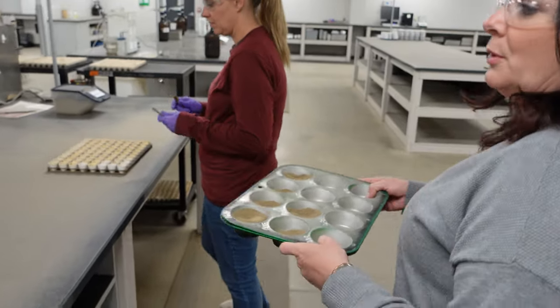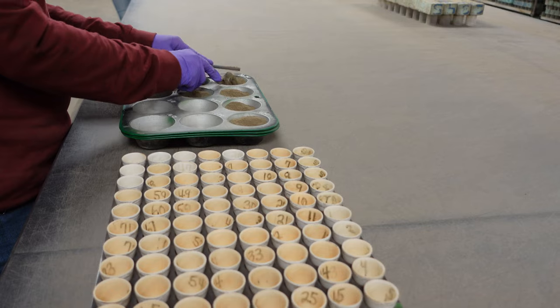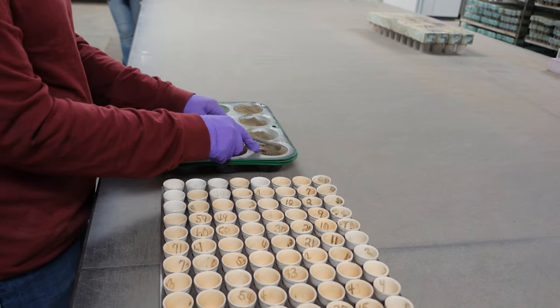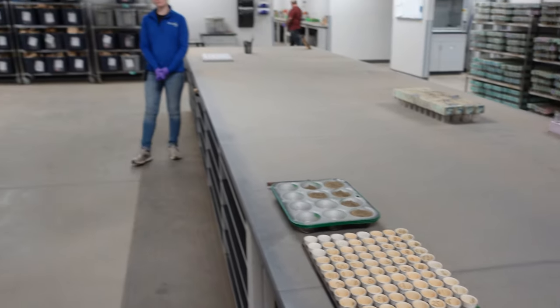We will know at the end of the day when we review the data — we check and ensure that all of our quality control samples are within our designated ranges before our samples are approved for the day. For organic matter, these are called crucibles and they are going to go in a muffle furnace and be burned at 360 degrees Celsius overnight. First we'll capture a dry weight — the samples after their scoop go in the drying oven for approximately an hour, then on to one of our robots to collect a dry weight, and then into the 360°C oven to ash overnight.